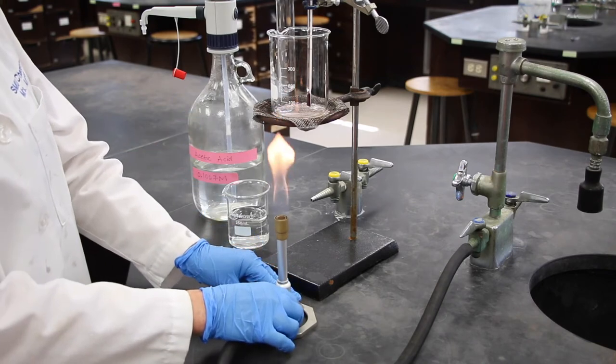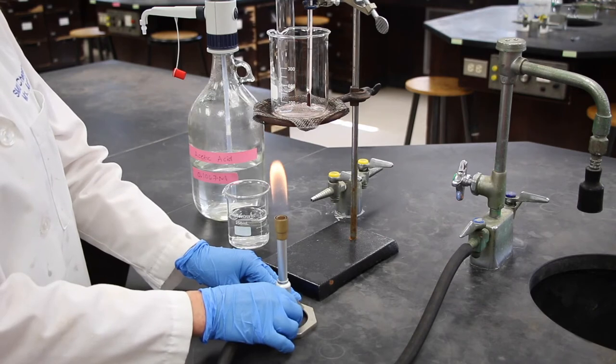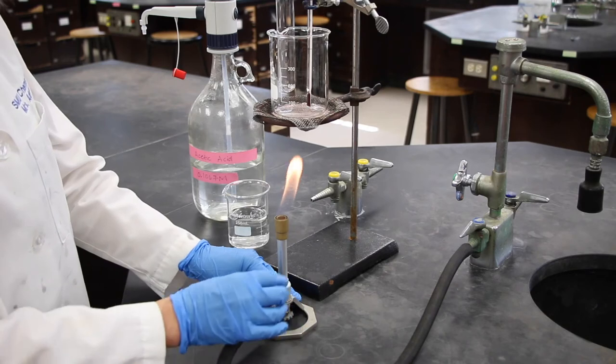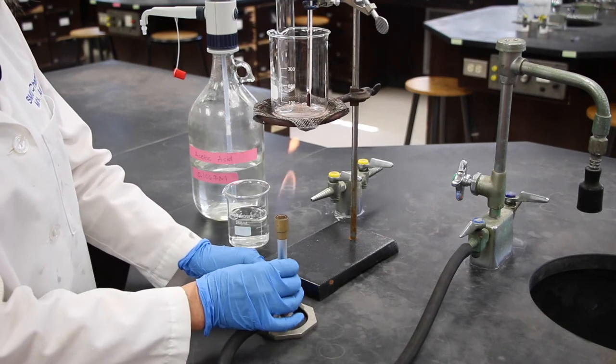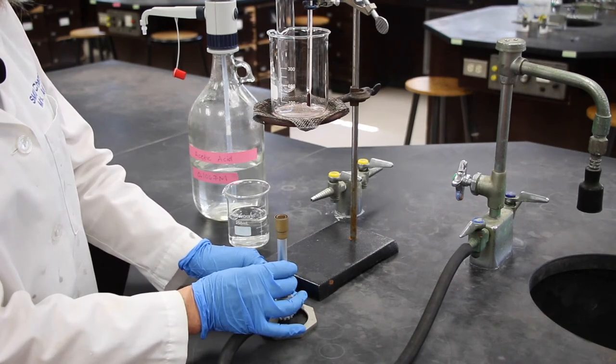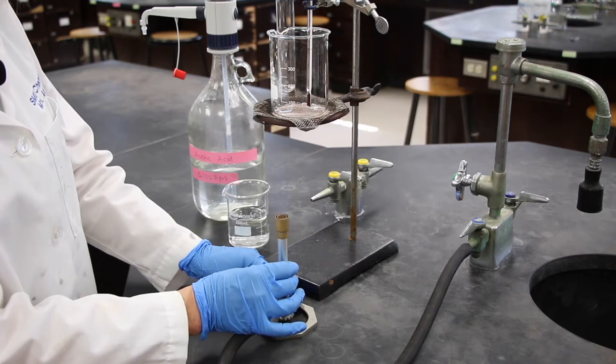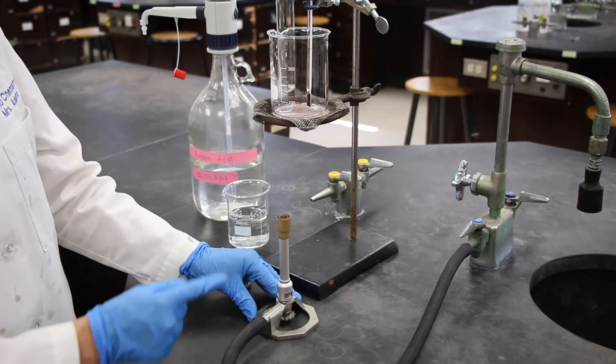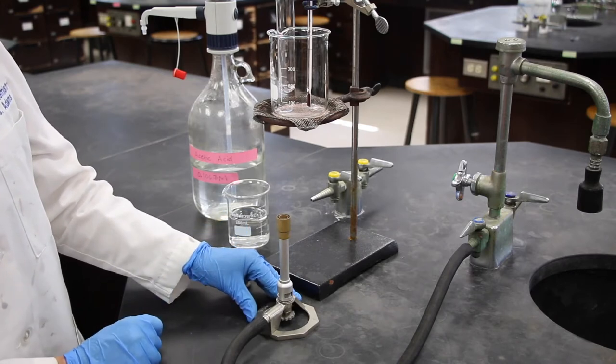So the first thing we're going to do is we're going to adjust the height of the flame, and that seems to be a pretty good height. And then we'll turn the barrel, giving it a little bit more oxygen, until we have a large blue flame with a blue cone inside.